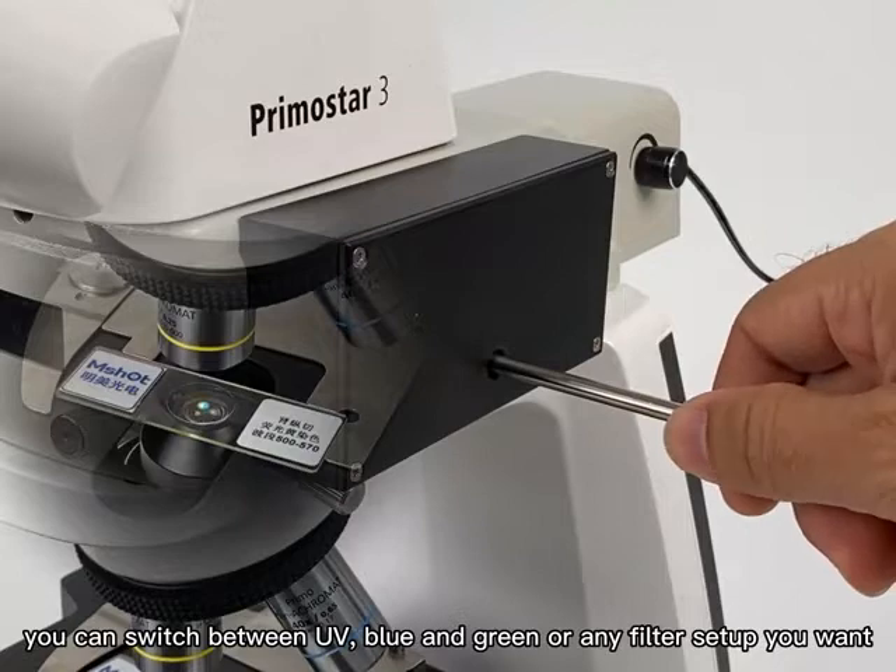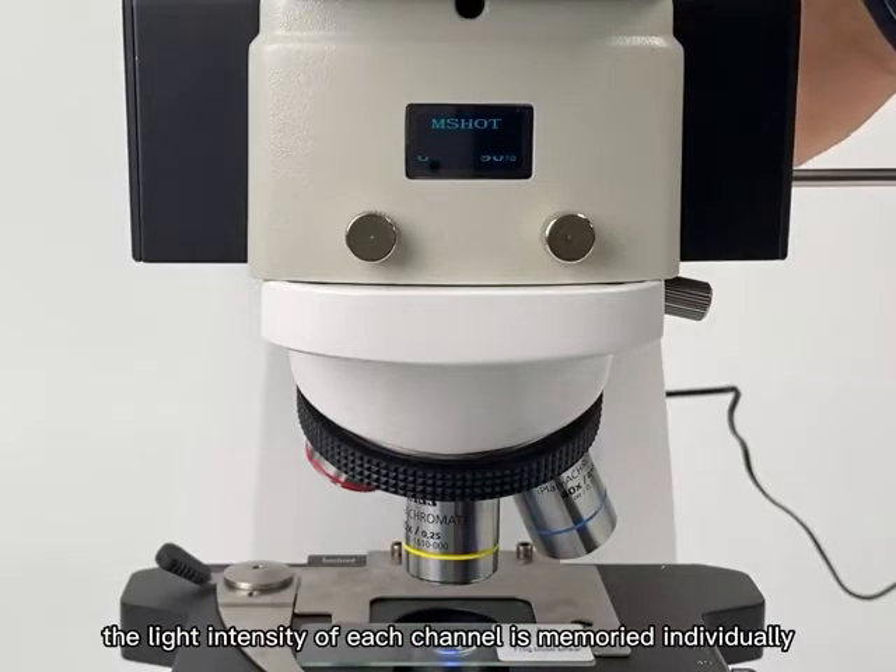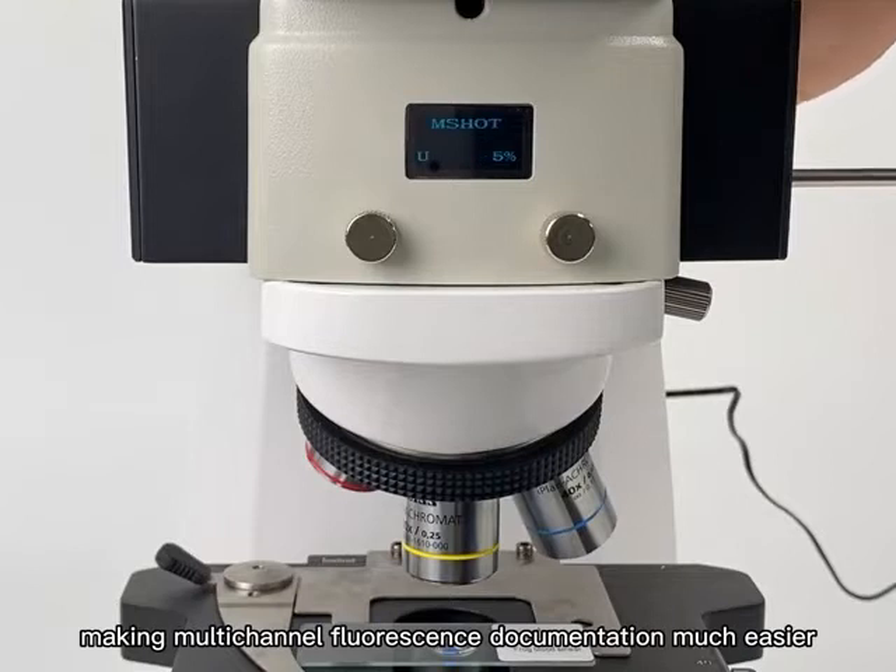You can switch between UV, blue and green, or any filter setup you want. The OLED screen in front shows the current channel and light intensity. The light intensity of each channel is memorized individually, making multi-channel fluorescence documentation much easier.